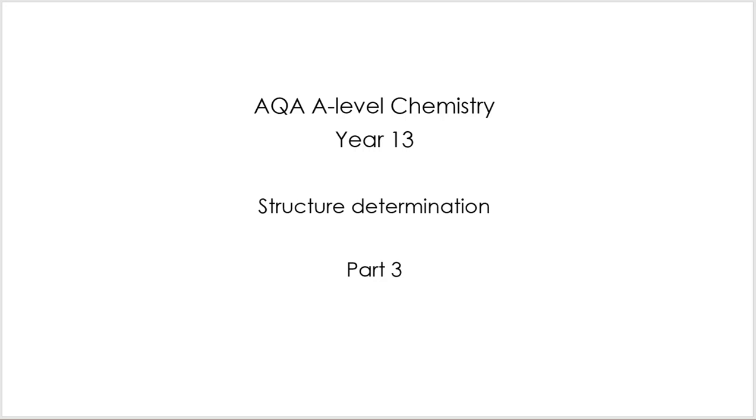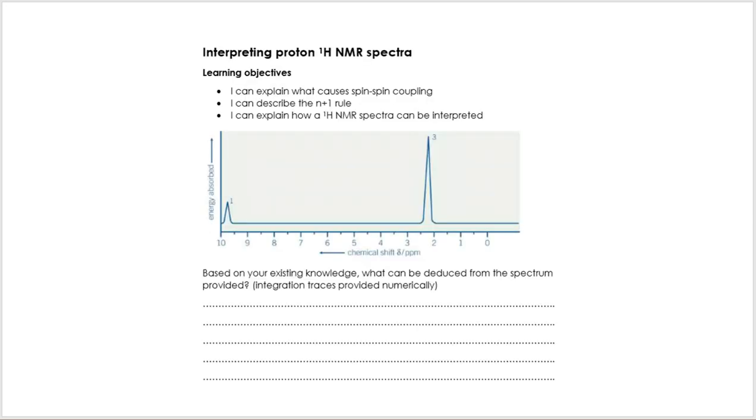Please do have a go at the activities. You then get to know what's going well and what might need more attention. So let's begin with the first activity. We're looking at interpreting NMR spectra, following on from what was in the last video really.